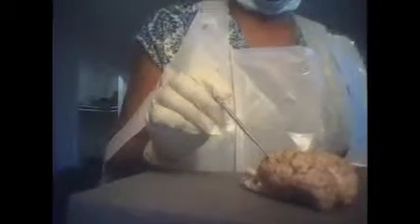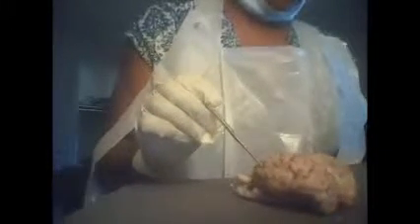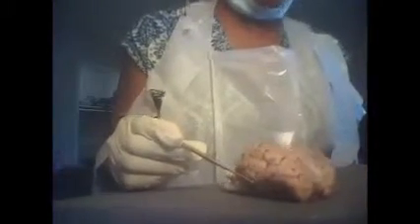The parietal lobe is posterior to the frontal lobe. The temporal lobe would be on the side of the sheep brain, and the occipital lobe is somewhere where my pointer is, the occipital lobe.